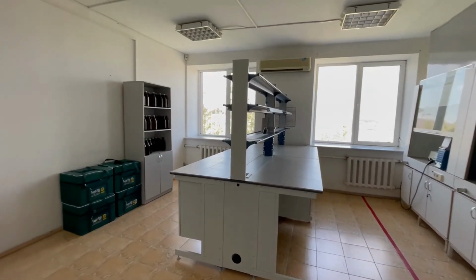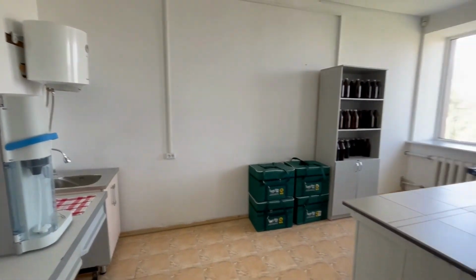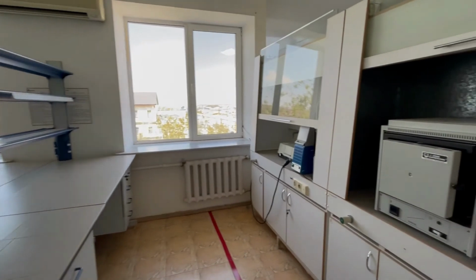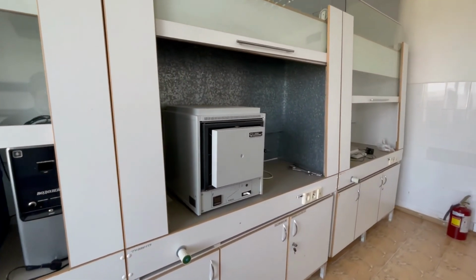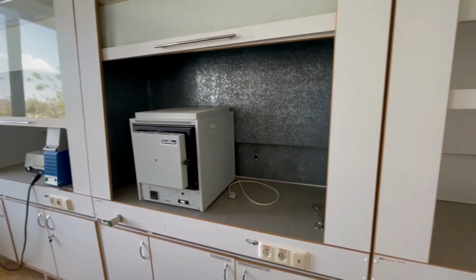The third ecological lab contains the water distillation equipment. Here is a soil analysis table. Here we have another photocalorimeter and the oven, which is heating above 600 degrees.